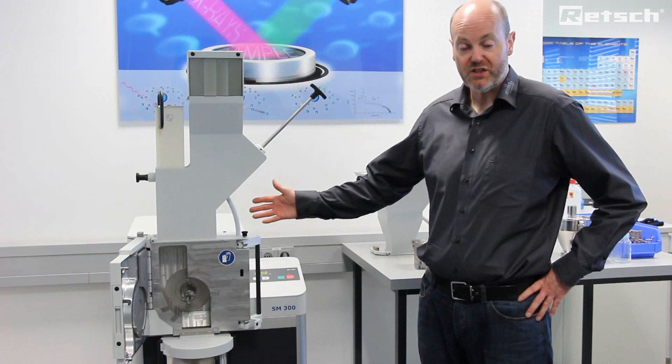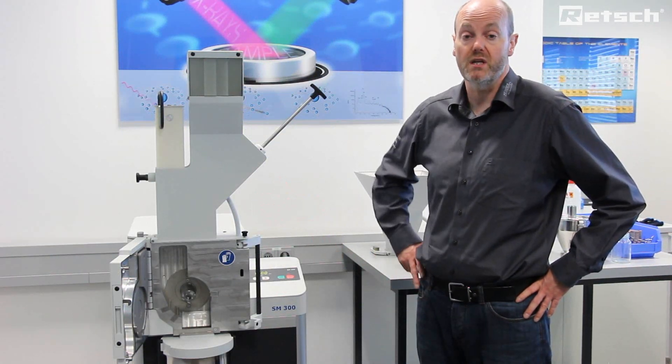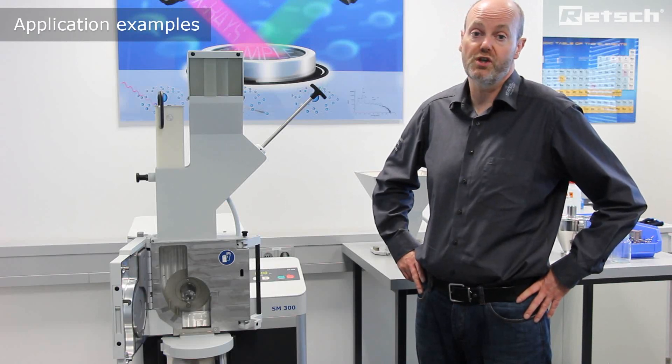The SM300 instrument is an extremely powerful and versatile machine which can be supplied with a very wide range of accompanying accessories. This can facilitate many application areas, common examples of which are the following.